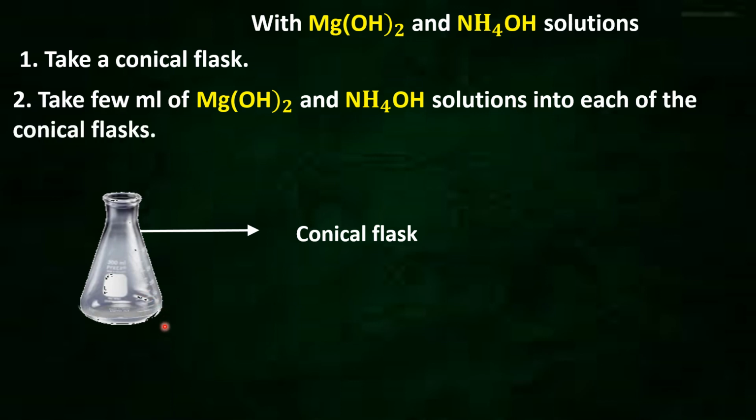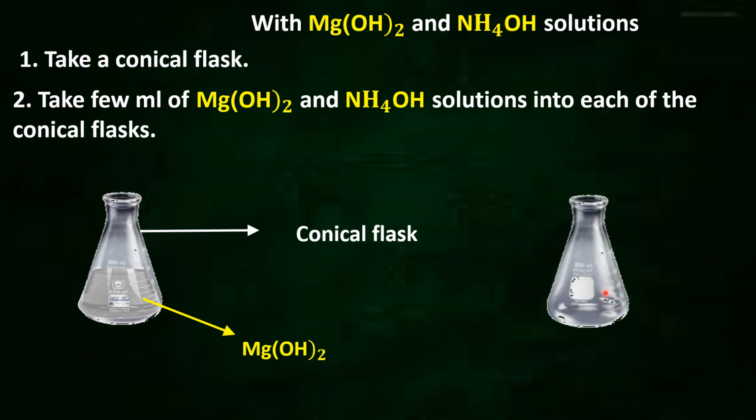Now here we are taking magnesium hydroxide. This is the magnesium hydroxide solution. And here we are taking ammonium hydroxide solution. Yes, this is the ammonium hydroxide solution.